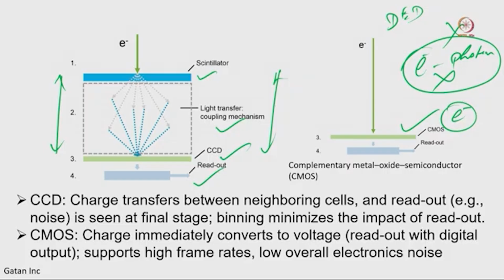Now when the electron hits the sensor, it immediately records all the signals to the readout, and we get much faster and much better images. That is going to help us with our biological samples. As we all know, biological samples are temperature sensitive, and this cryo sample is staying inside the amorphous ice.